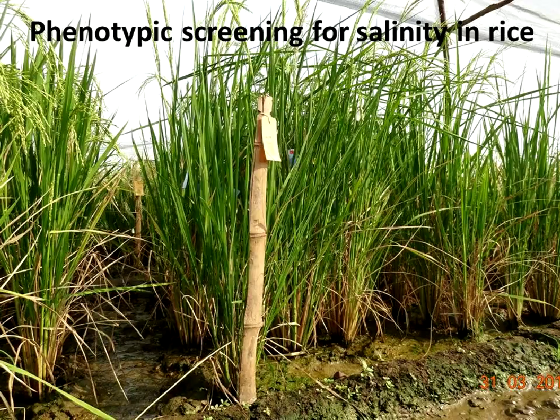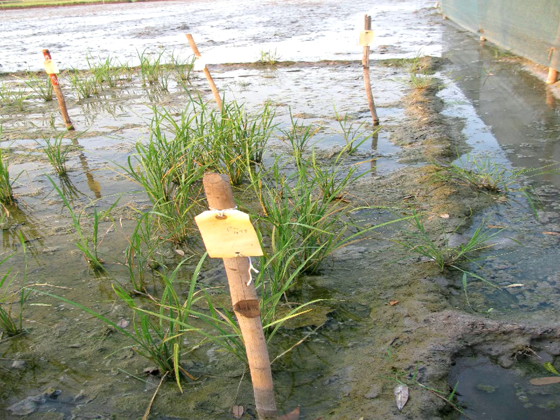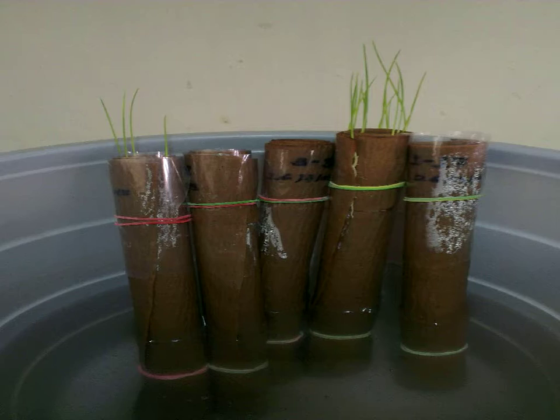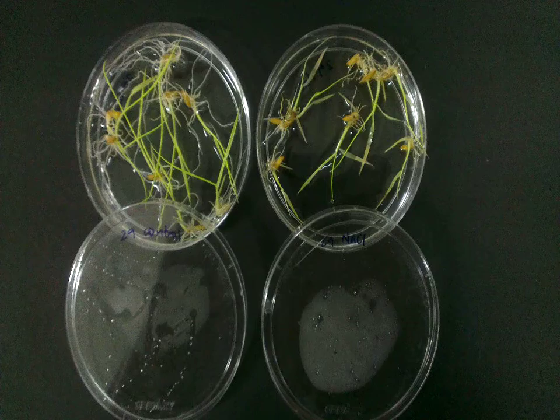This video presentation is about phenotypic screening for salinity stress in rice. Generally there are four phenotyping methods: field level screening, pot culture screening, hydroponics, and roll towel. For this study, a different method has been used — screening by using petri plates.